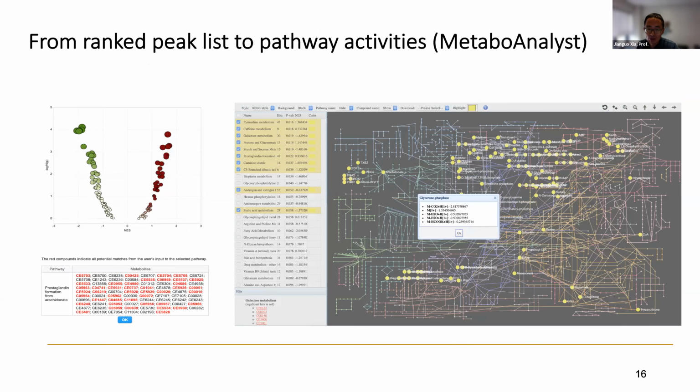So this is a newer feature. We allow people to work with their raw peaks. Basically, peaks come from mass spec, and for most people they are not interpretable. If you directly analyze them, you have no feeling about what they are. For example, you can search genes and metabolites, but peaks are almost uninterpretable. But peaks you can directly generate from mass spec. So we use GSEA, for example. We allow people to directly interpret their metabolomics data from peaks to pathways.